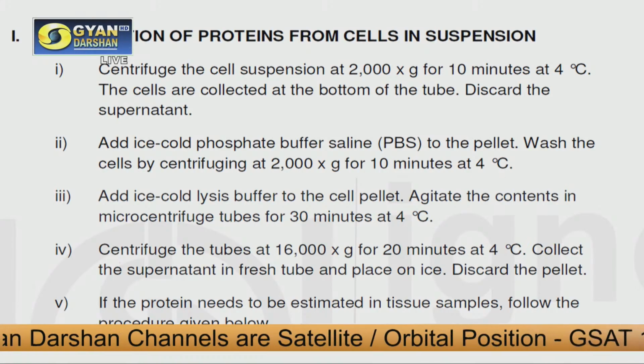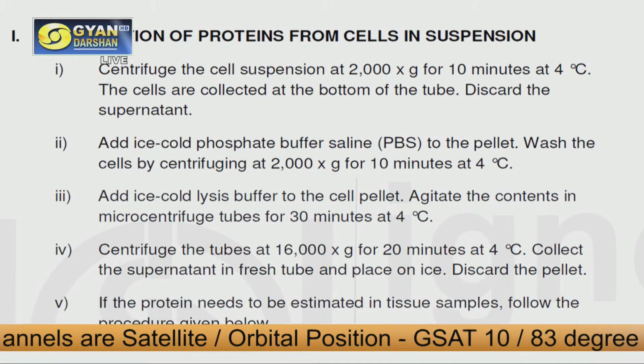Now you discard the pellet because you have undergone cell lysis, so the protein will go to the supernatant. Use this supernatant as a source for the total protein.